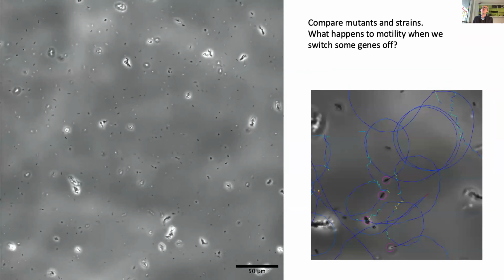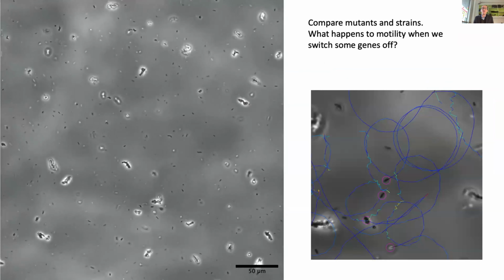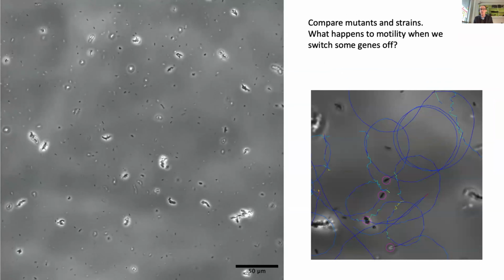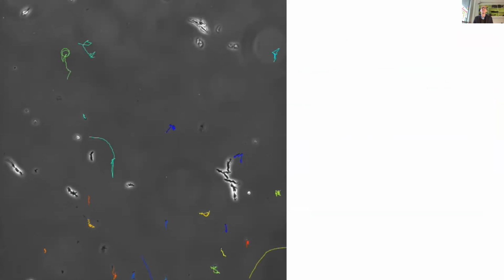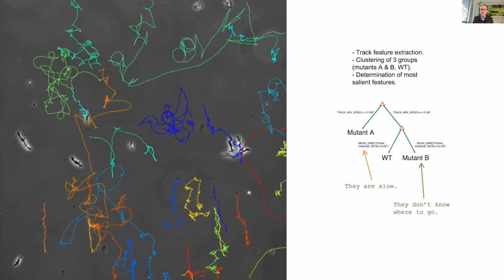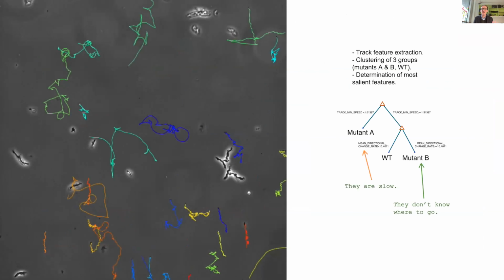I just wanted to tell you that image analysis is the extraction of quantitative information from images, but it's never the final answer. As a bioimage analyst, if you want to go there, you need to see a little bit beyond and know about data analysis, something that can make sense of the image data you've been able to extract. But this is a full topic on biostatistics and bioinformatics.